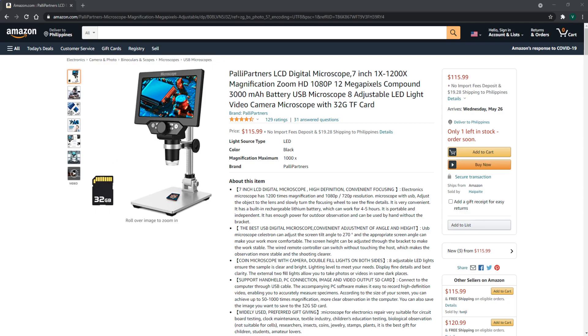So today we're going to be checking out the LCD microscope by the guys over at Pali Partners. This big boy carries a whopping 7-inch display and the microscope has 1200x magnification zoom. It's 1080p HD with 12 megapixels on the camera and a compound 3000 mAh battery.